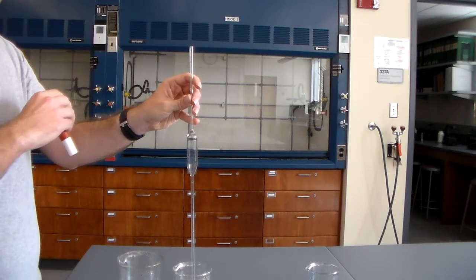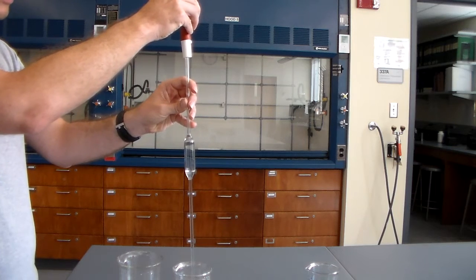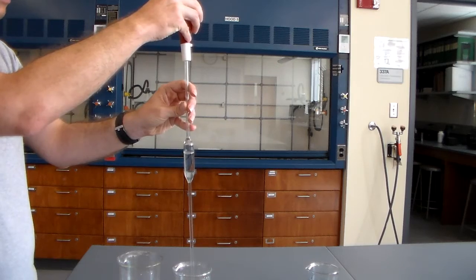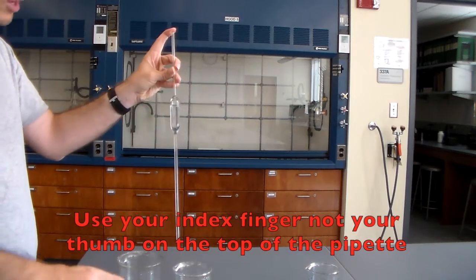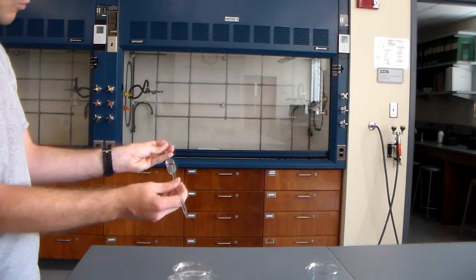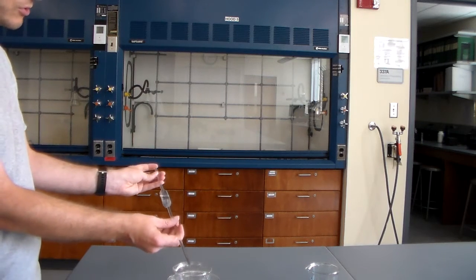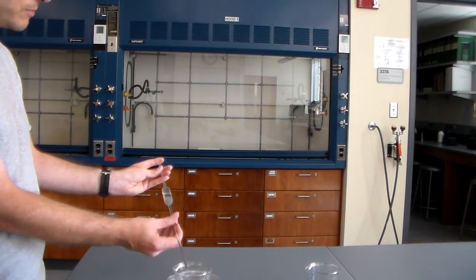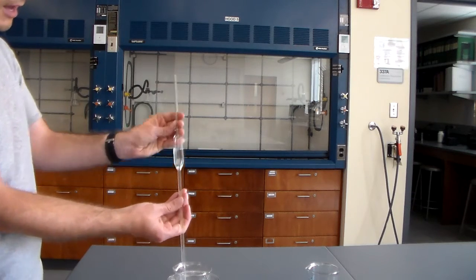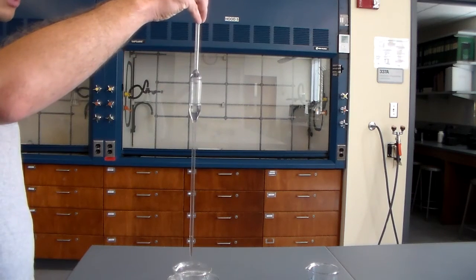So when you're cleaning this out, the first thing you want to do is just squeeze the bulb and then suck up some water. And you only have to get about half filled here. And once you're satisfied with that, you can just hold it over a waste beaker and then just swirl it around to make sure that the water contacts all the insides, and then just let it slowly drain out and keep spinning it just to make sure that all the inside surfaces have been thoroughly washed. And once you're done with that, just let the water drain out naturally.